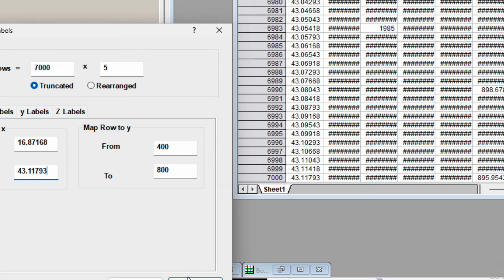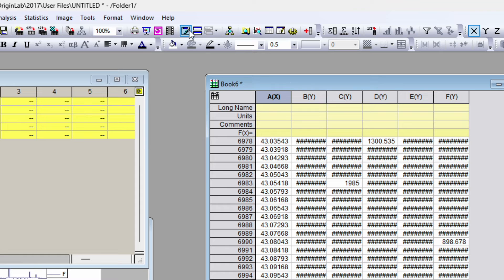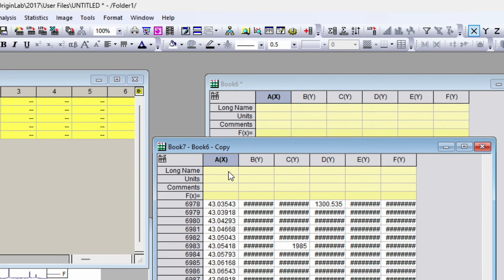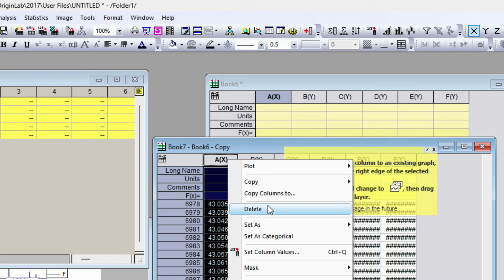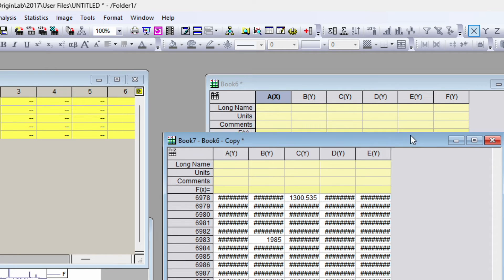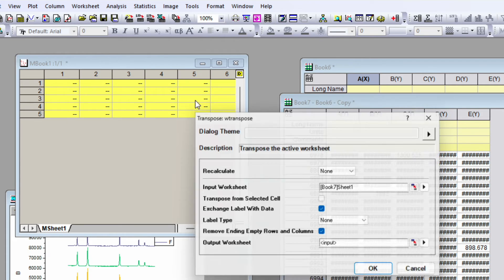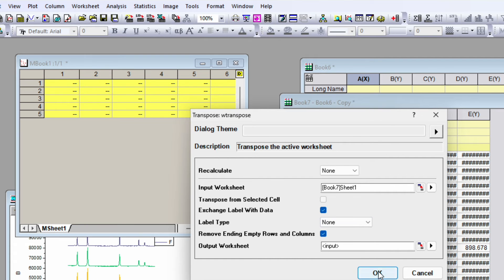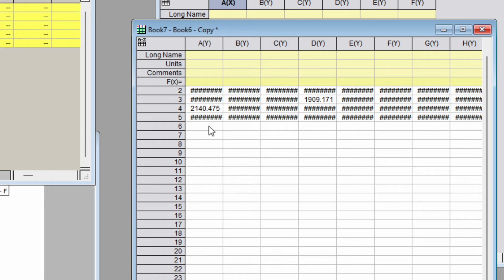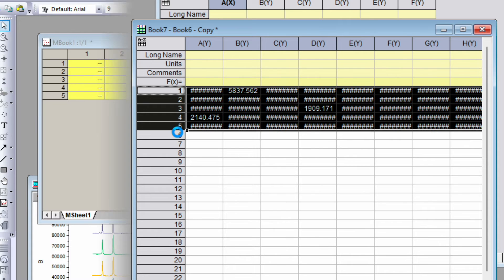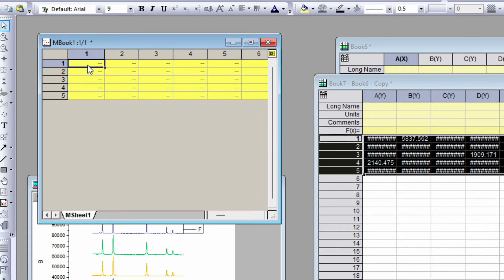Now duplicate this worksheet by clicking the duplicate symbol. We don't need the x-axis column, so right-click and delete it. Then go to Worksheet → Transpose and open the dialog — you don't need to change anything, just click OK. This transposes rows to columns and columns to rows. Select all five rows in the transposed worksheet and copy them.